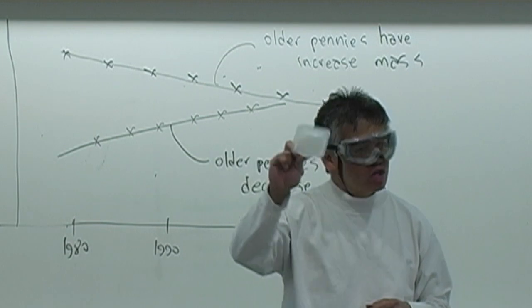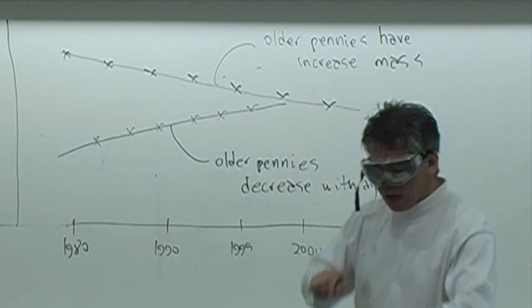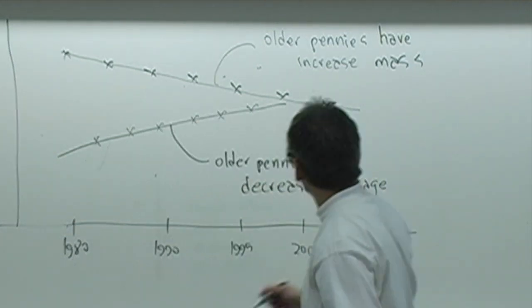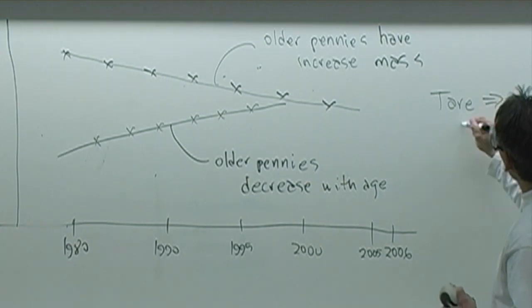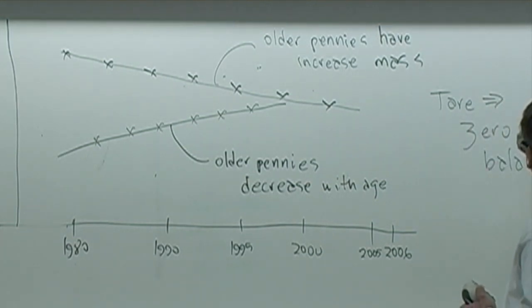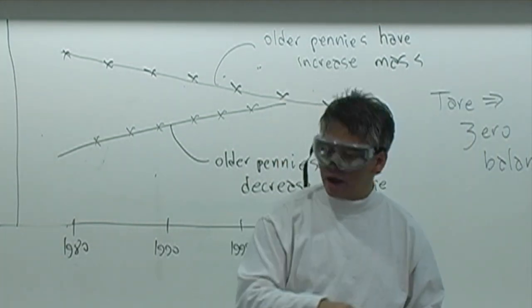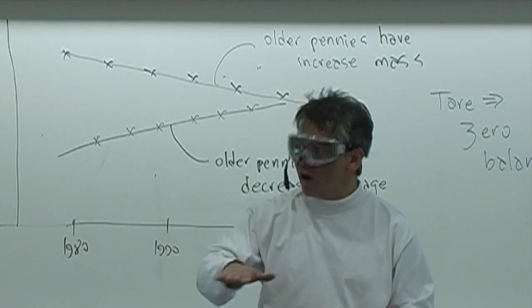What you want to do is just place the weighing boat on the balance and then tare it. Not tear, but tare, T-A-R-E. Tare simply means to zero the balance. What does that mean? It means that the reading now on the balance is 0.00 grams. Not that the weighing boat is 0 grams, but now you have a reference point.